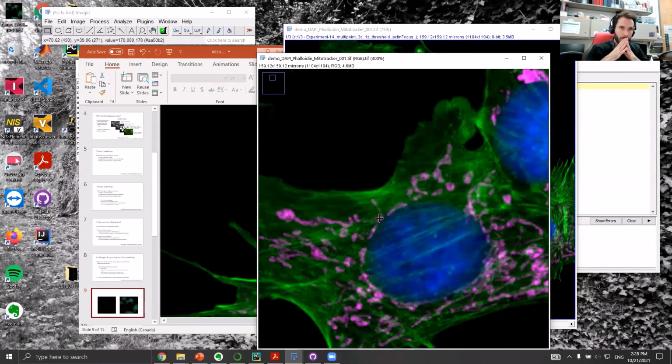Actually, now that I think about it, I may have made a mistake here. It's similar to flattening the image, yes, in that we do lose information, or the information is re-encoded into RGB. So yeah. Oh, the questions should be in the chat. Okay, so we'll carry on for a little bit.